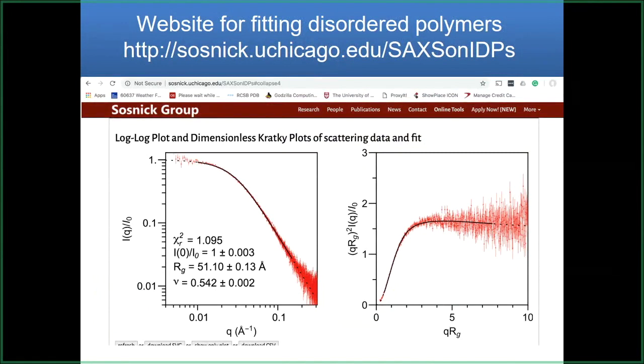But this is why this is just one of the things you can look at. You can look at NMR to see if you get any dispersion in the peaks. You can look at CD. Look at chemical shifts. You can't just look at your system with one tool. So yes, hydration is going to be an issue. If you have a region of hydrophobic residues, maybe they ball up a little bit. Maybe some region forms a helix. All of the above is possible.